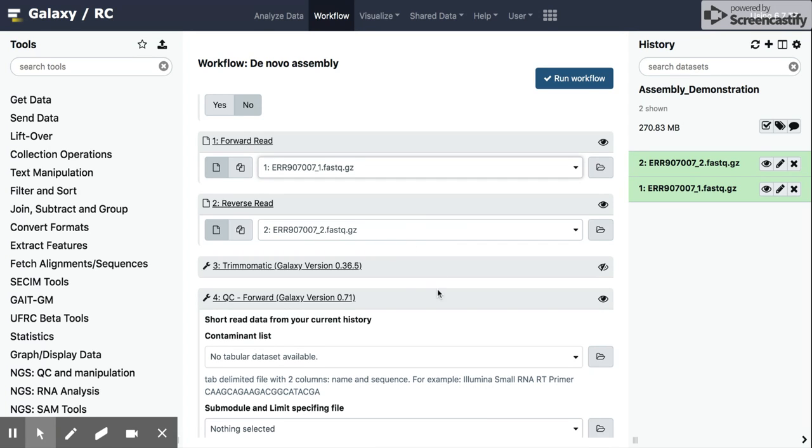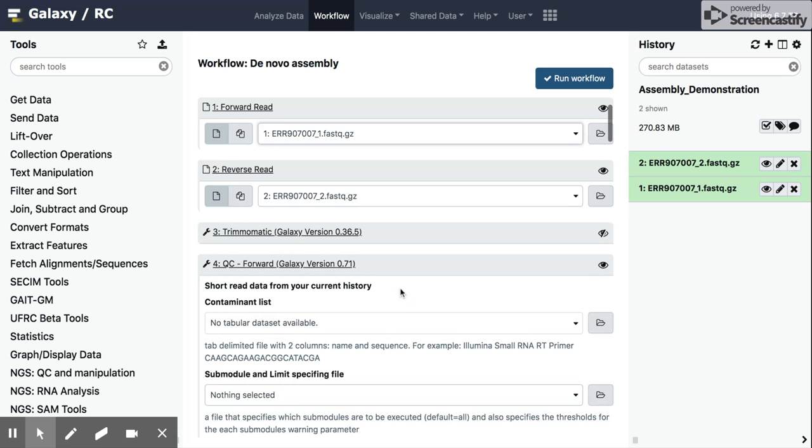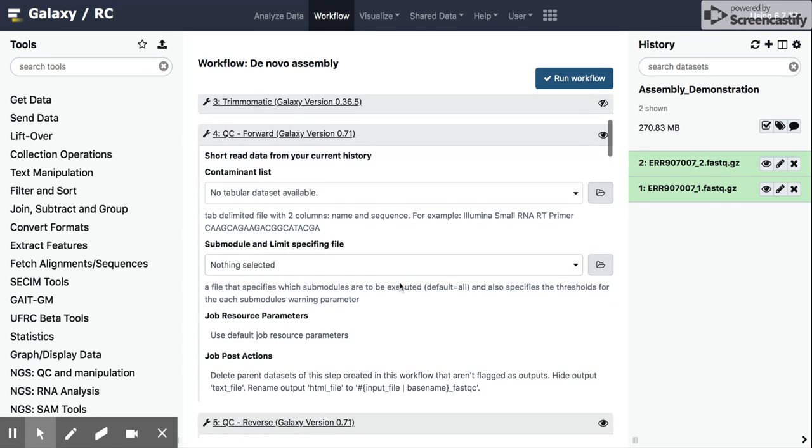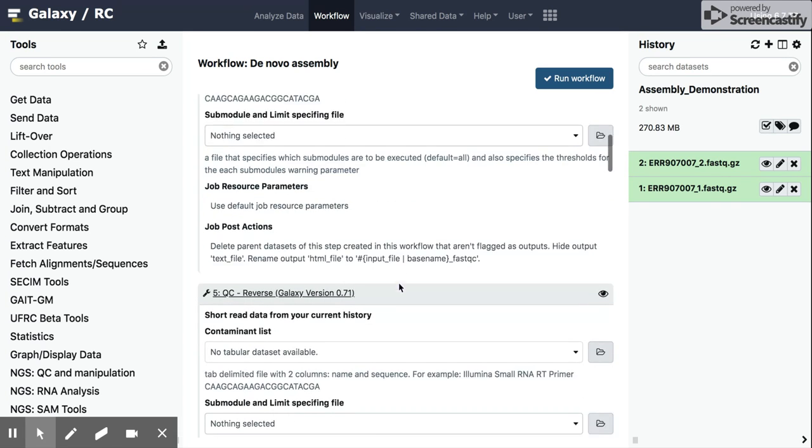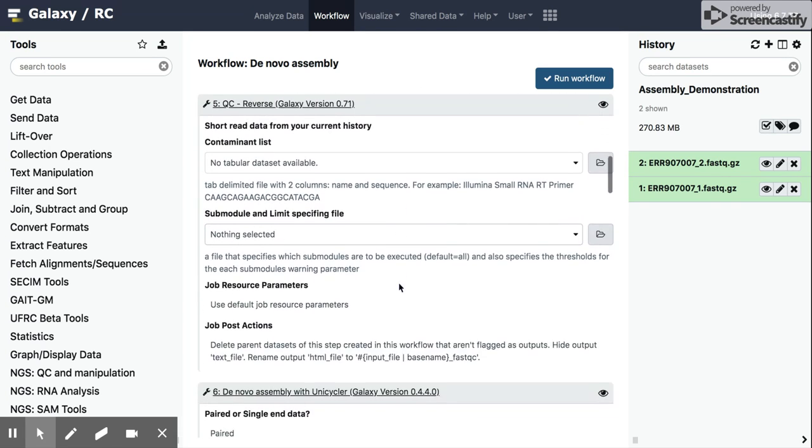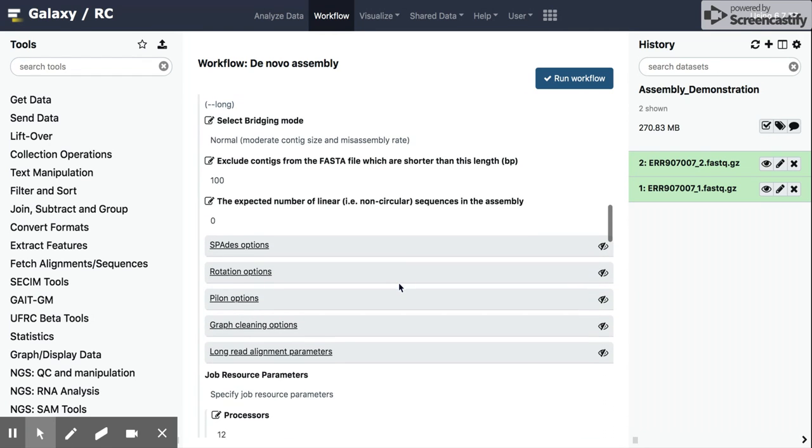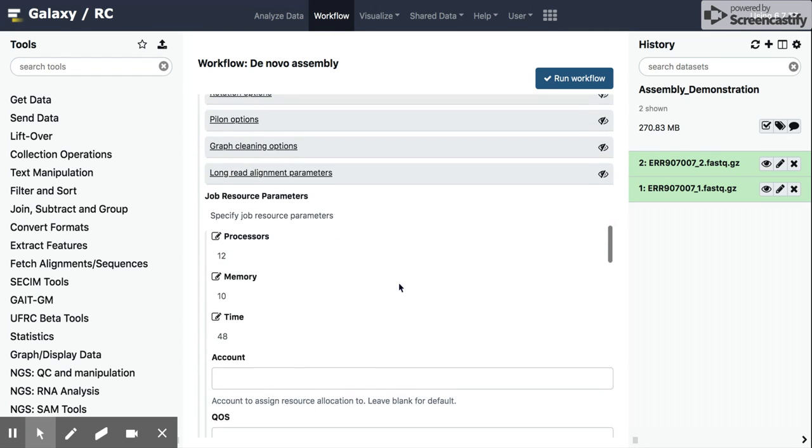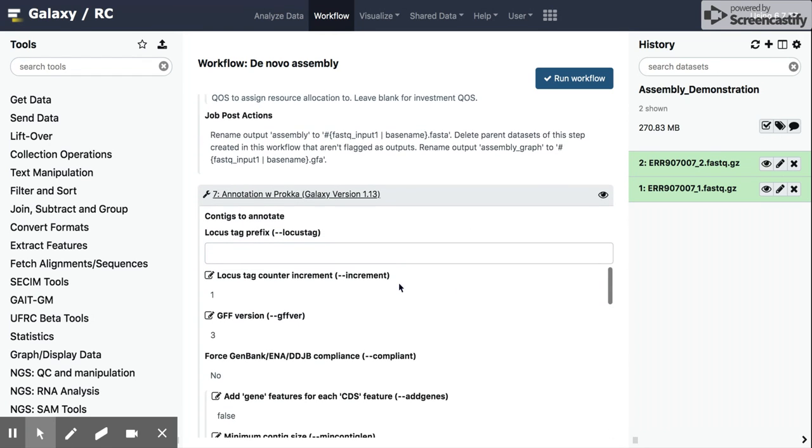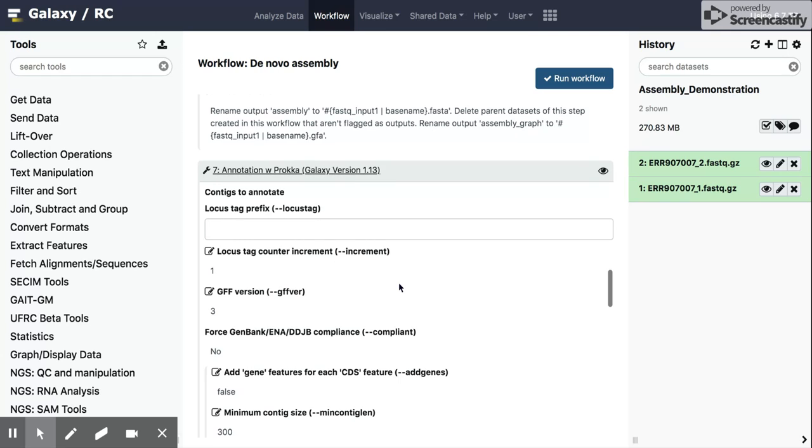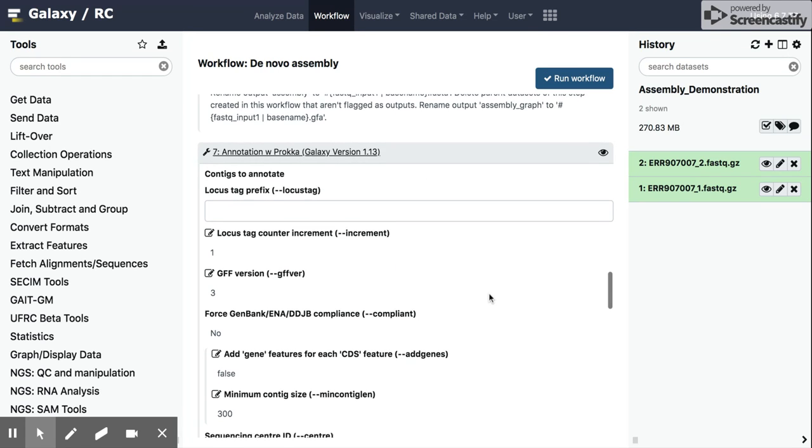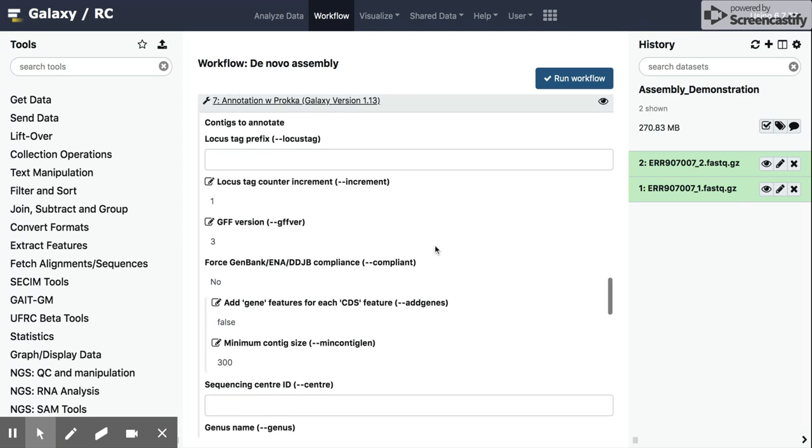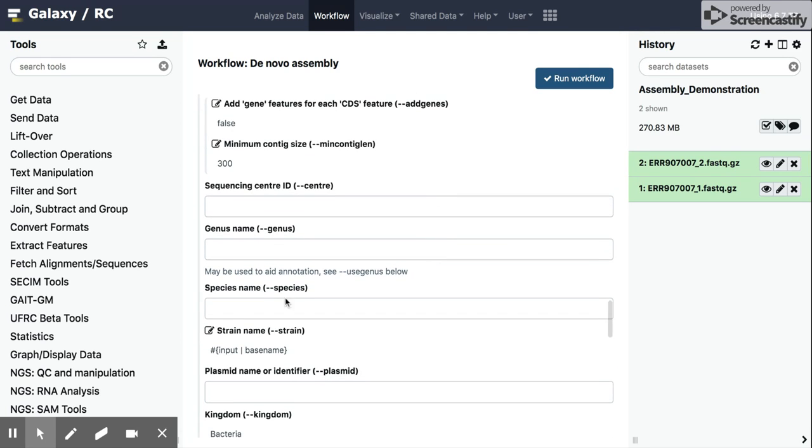We see our Trimmomatic step, which we don't need to change any parameters. We can go through the assembly statistics. And the main thing we're going to have to change is if we go down here to the annotation with Prokka. As we discussed in a previous video, you can see that locus tag, which we're leaving blank, and then genus and species.